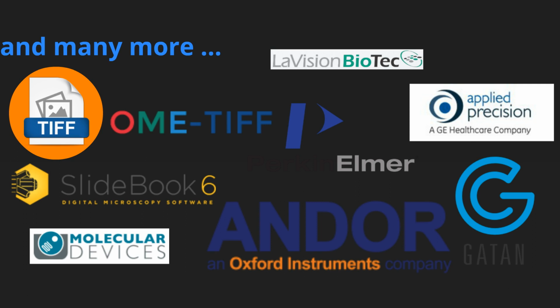So if you have an option and you can use one of our supported formats, so maybe you're using a Zeiss or a Leica system, keep it in their format rather than exporting out as TIFF. Or if you're using TIFF, also export out the LIF so you can bring that into Imaris. Okay? Now, there are some special TIFFs out there. And there's a TIFF format that Micromanager spits out. There are TIFF formats that the Prairie system spits out.